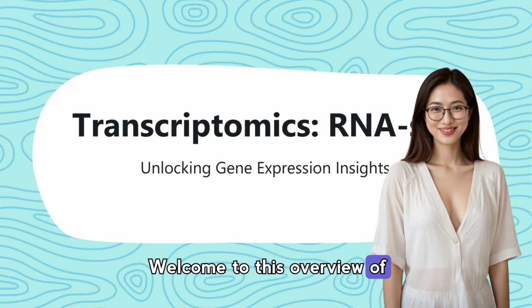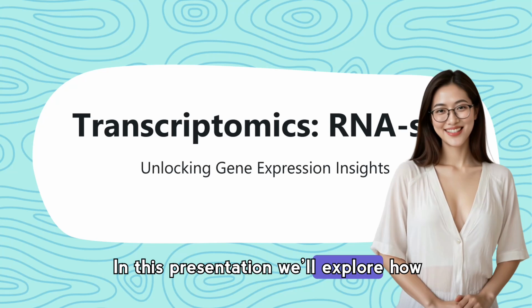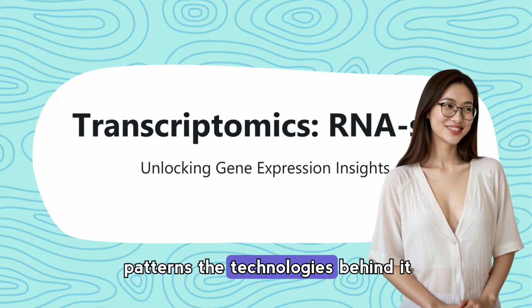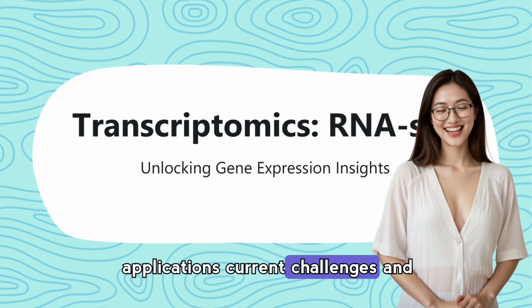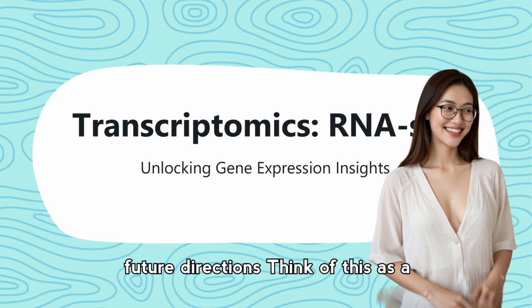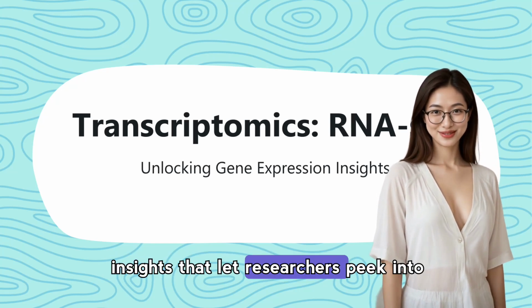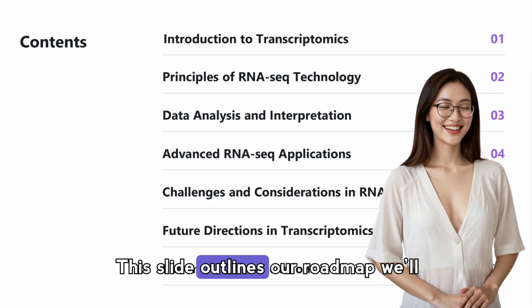Welcome to this overview of transcriptomics and RNA sequencing. In this presentation, we'll explore how RNA-seq reveals gene expression patterns, the technologies behind it, key analysis steps, advanced applications, current challenges, and future directions. Think of this as a guided tour through the methods and insights that let researchers peek into how genes behave in cells and tissues. This slide outlines our roadmap.